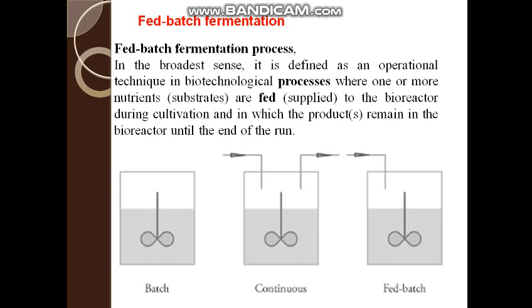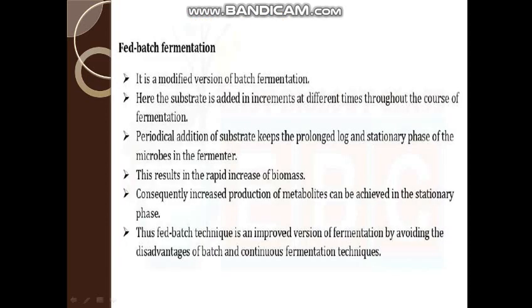These are the various diagrams of fermenters in which various fermentation processes are carried out. For example, this is the batch fermentation process, this is the continuous fermentation process, and this is the fed batch fermentation process. So we are interested in the fed batch fermentation process. It is obviously a modified version of batch fermentation process, and we add the substrate at different time intervals for fermentation, and we keep that substrate through prolonged log and stationary phase.